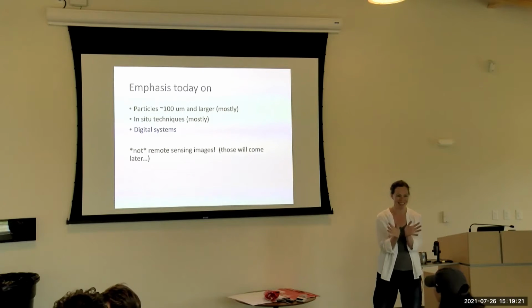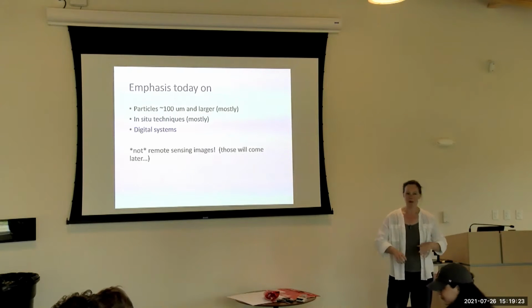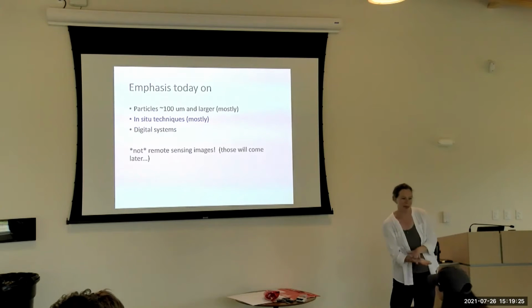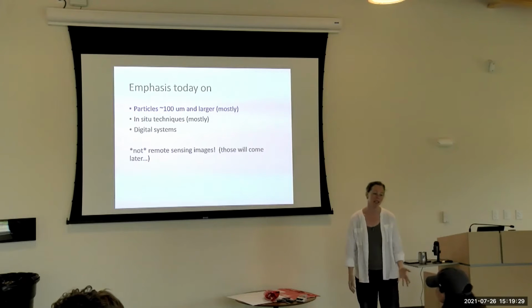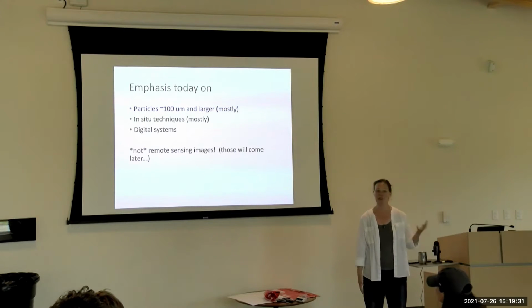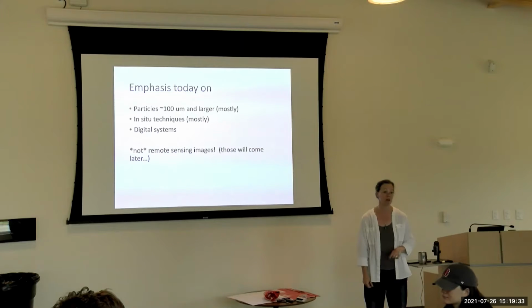If you use an oil immersion lens, you can image something a little bit more finely resolved than that. But there is a limit, just based on the physics of diffraction, to how small the image will be.